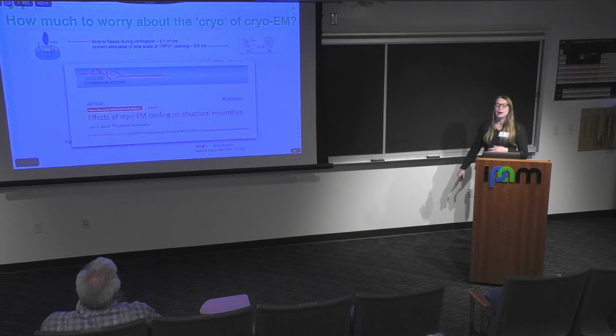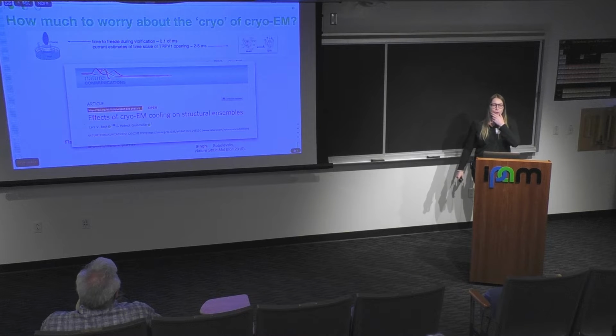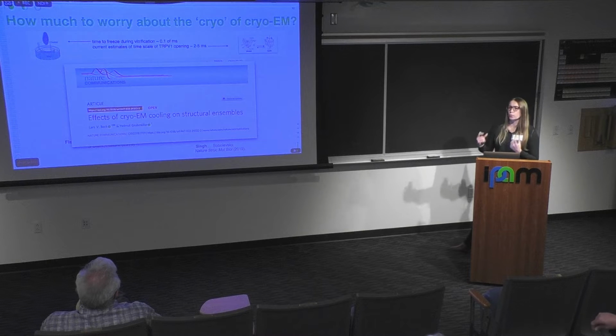And then lastly, another aspect of cryo-EM is the ensemble that we have represented in our vitrified sample. What is actually happening during vitrification in this ice? This is a nice computational paper here that starts to ask these questions and provide some answers. But I think there's a lot more that we could do to really understand these questions better.